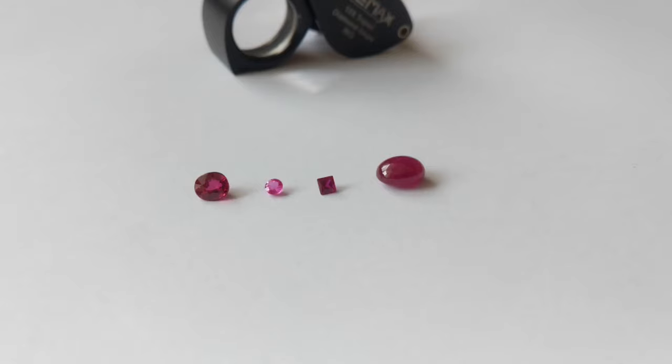And actually rubies can only be told by looking it under the microscope, or if there's no inclusion you have to send it to a gem lab, a professional third-party gem lab, and that's the only way to tell if a ruby is a synthetic or natural. So now let's look at each of these three synthetics under the microscope so I could explain to you what you have to look at and tell the difference between a natural and synthetic.